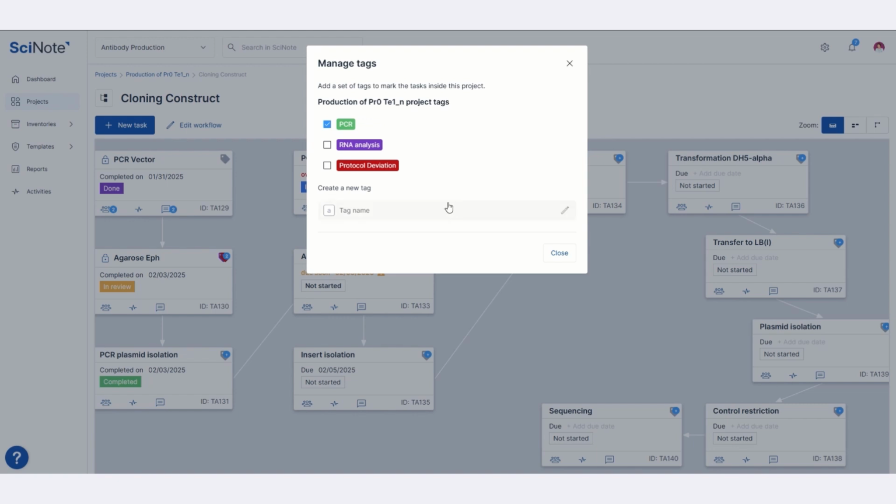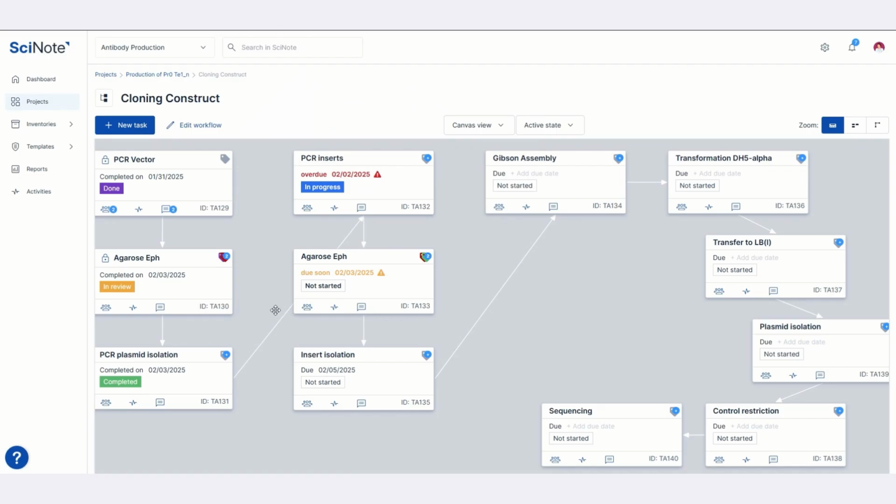If a series of tags are already created, you can select which tags you would like to include. Once finished, click Close. To learn more about SciNote, continue watching our tutorial videos and explore the resources linked below.